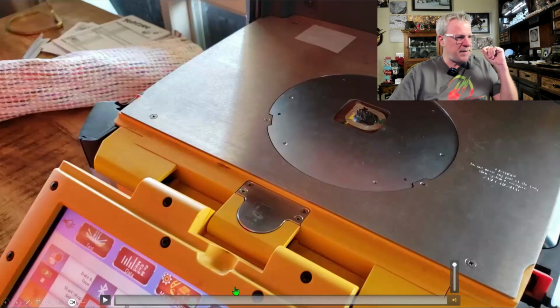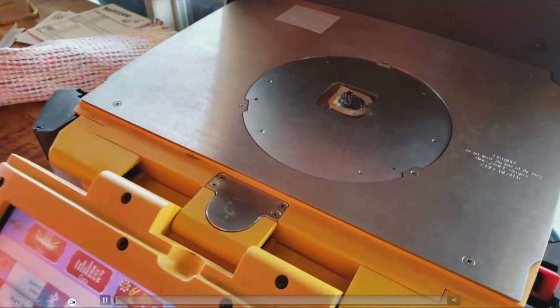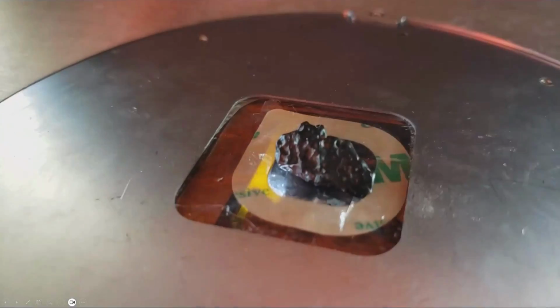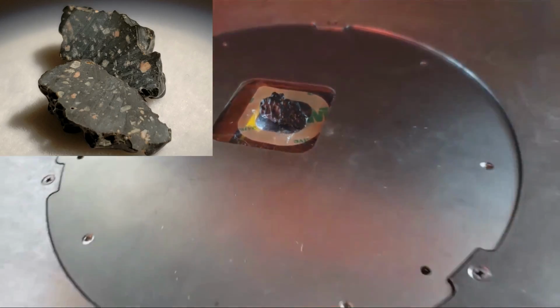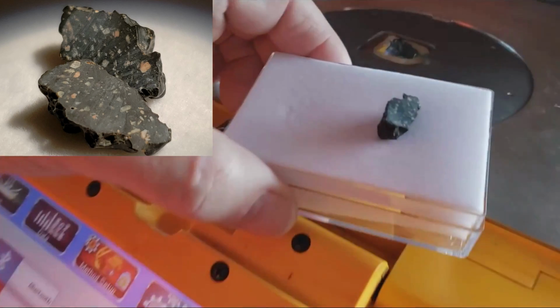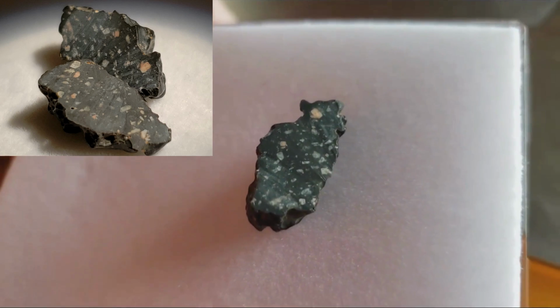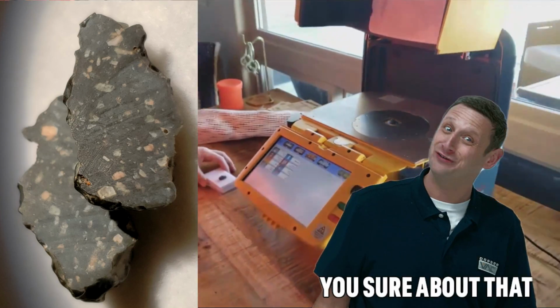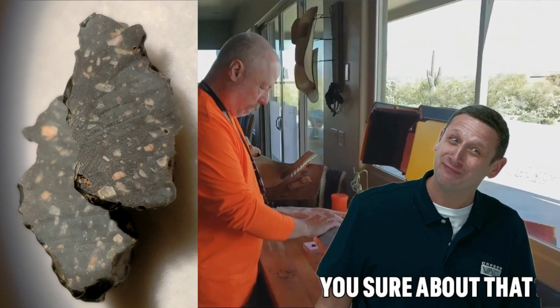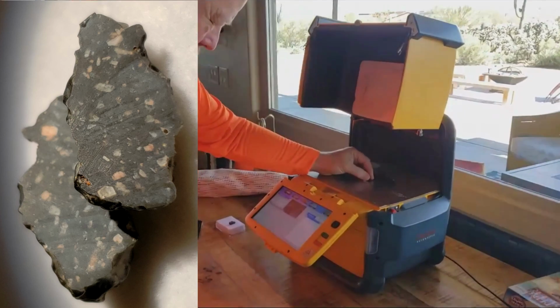Here's another example of an XRF machine, and this is in the Meteorite Mansion featuring our own Pat Brown. What we have here is my potential lunar that I found in an NWA bin, and Pat is putting it on. This is the other half. We cut it last night. Matt Stream and I cut it last night, and it looks really good for potential lunar. So we're going to run it. Pat's going to run it through Dustin's XRF, and we're going to see what kind of results we get.